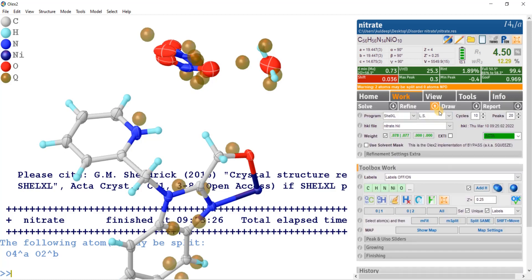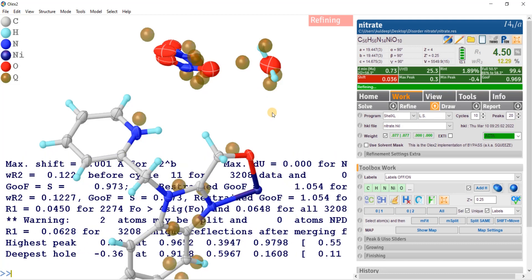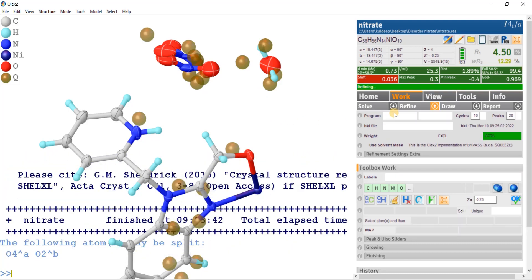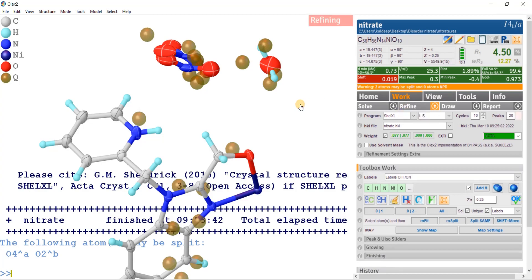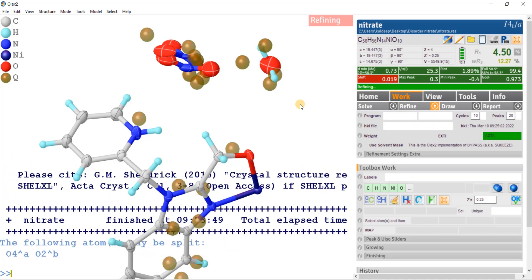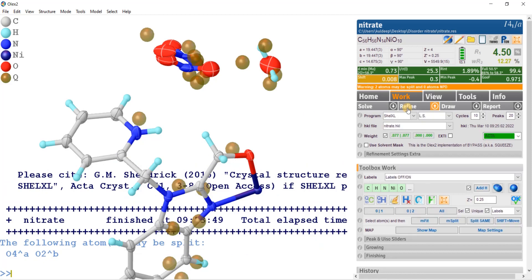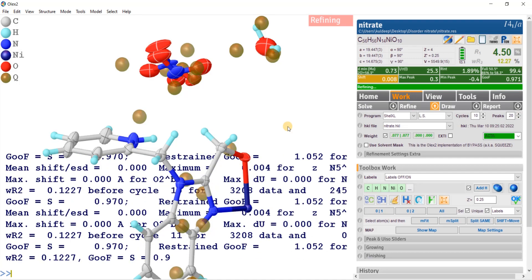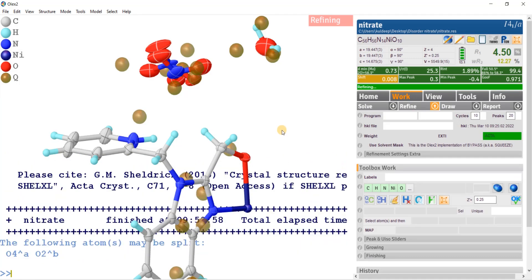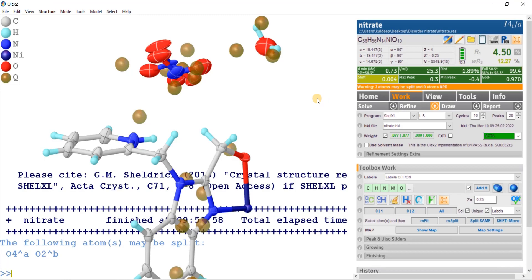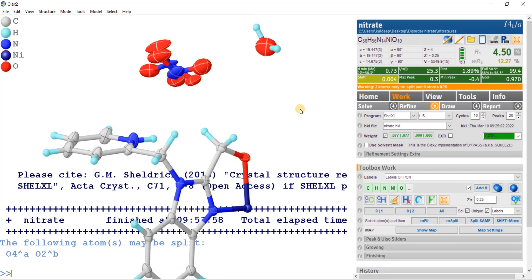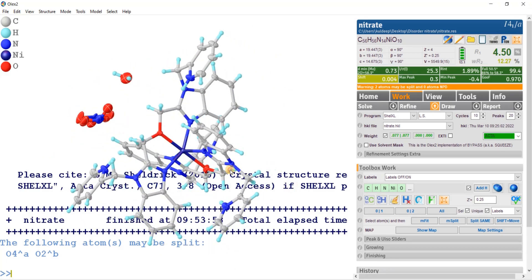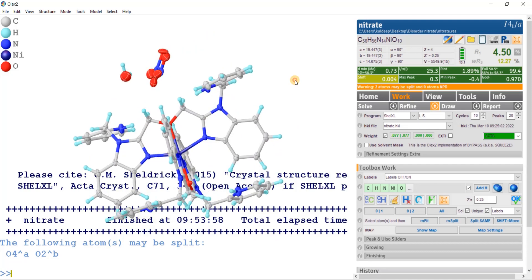Let's go to work and do a final refinement. Now everything seems to be right and looking nice. The refinement is converged. Turning QPEAKS off and pressing Grow — this is the full molecule: it is a hexacoordinated nickel 2+ complex.